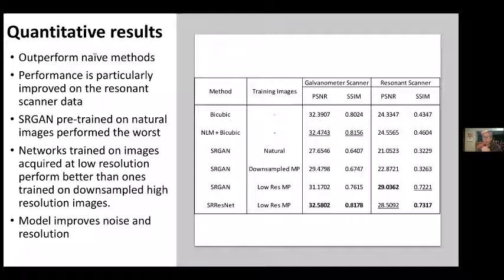I guess I was also thinking, this isn't really a question, but an observation. It makes sense doing what you were doing because your customers are probably used to looking at the images. But it's good to think about the final task. Sometimes I get involved with object recognition, where the processing of the images may not be for viewing, it may be for object differentiation or disease state evaluation, I'm guessing.